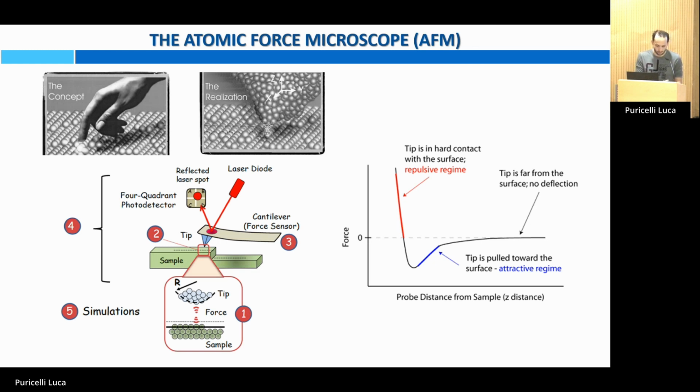Whereas when the cantilever starts being bent upwards, it means you are going into the repulsive regime. You are also squeezing the sample a little bit, and from this part of the force curve you can get mechanical parameters of the sample under investigation. So you can build several maps in one-to-one correspondence with topography, for example, for our case of interest, elastic parameters.